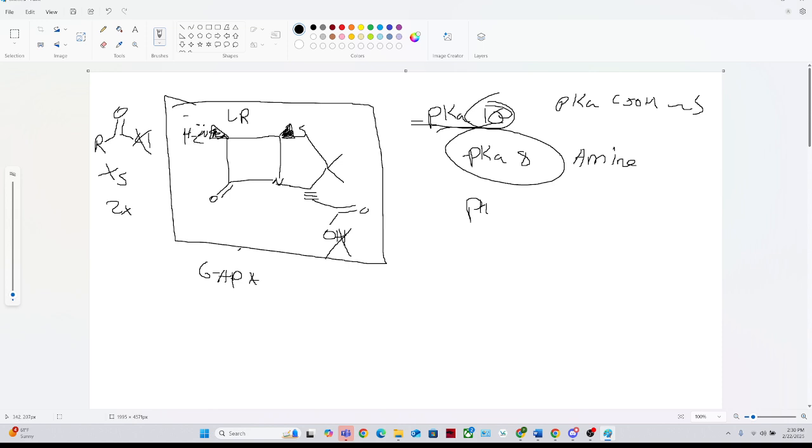This just helps your reaction kinetics, because if I were to add both the acyl chloride and the 6-APA at the same time, I would have to wait for my limiting reagent to get freebased before I can do a reaction. Whereas if I have it already freebased and I just add the acyl chloride afterwards, the reaction is ready to go.